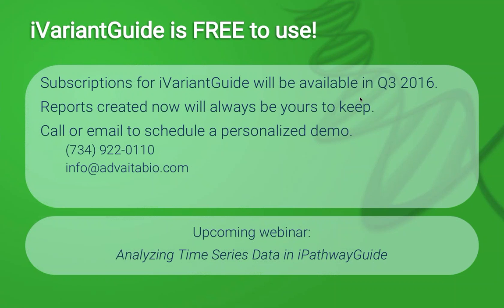I think we have time for one more question. By the way, if we didn't get to your question, we will answer it after the webinar concludes and follow up with you individually. The last one is, can we import other annotation sources into iVariantGuide? The answer is not yet.